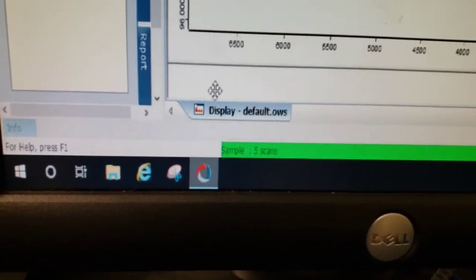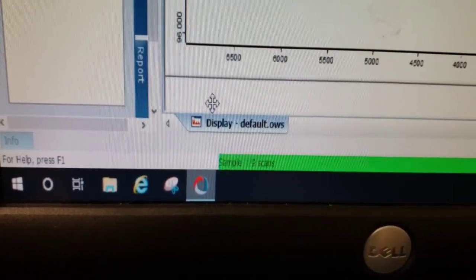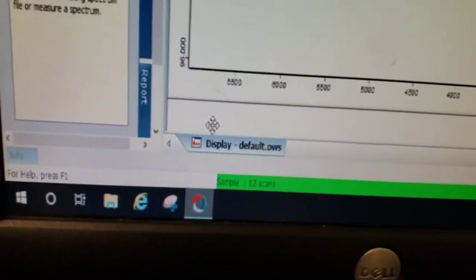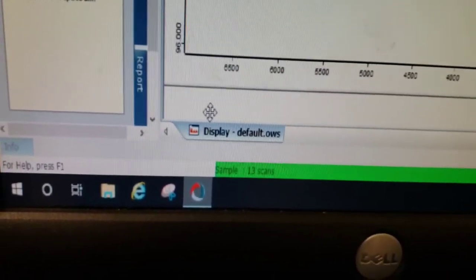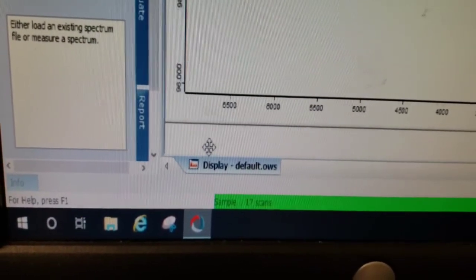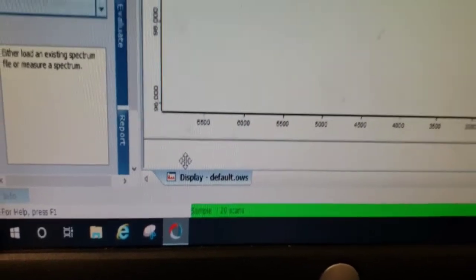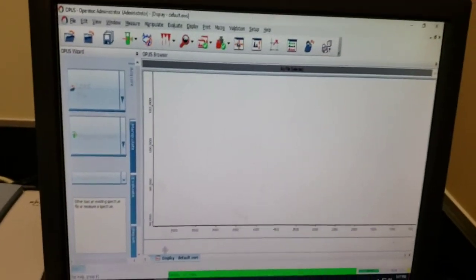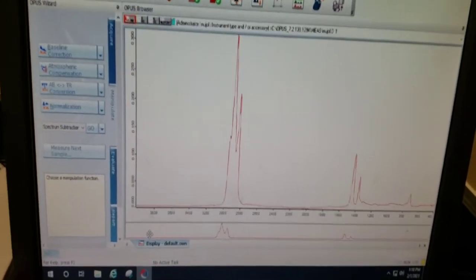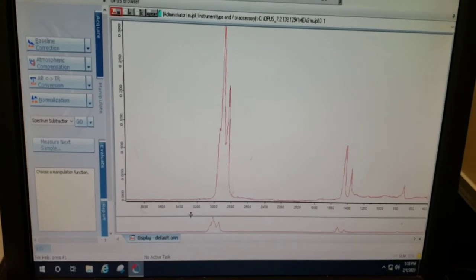The instrument collects scans of the same spectrum and then stacks them in computer memory. By doing so, noise averages to 0 and our signals reinforce. This gives spectra a much clearer overall picture at the end. Here is our spectrum.